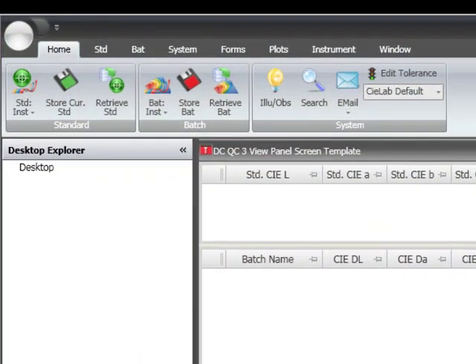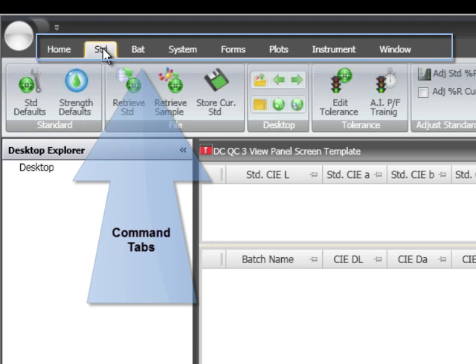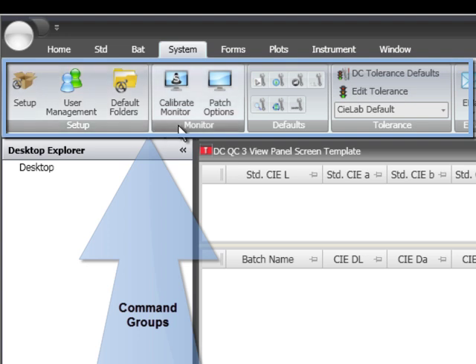The top of the program offers a new user interface that emulates Microsoft Office 2007. When the program opens, the home ribbon bar is shown by default. Command tabs replace original pull-down menus. Within the command tabs are command groups. Command groups are functions that are logically grouped together to allow fast access to information needed.